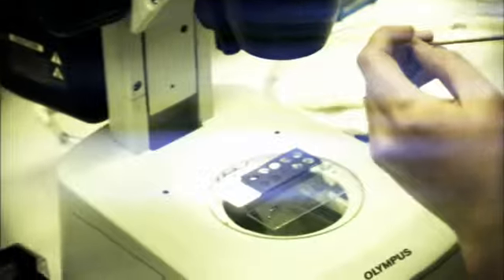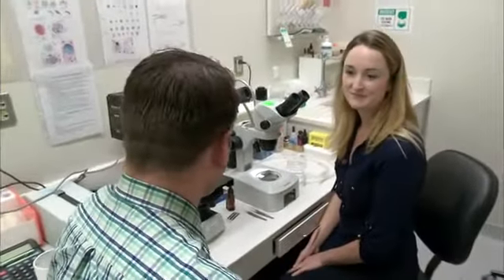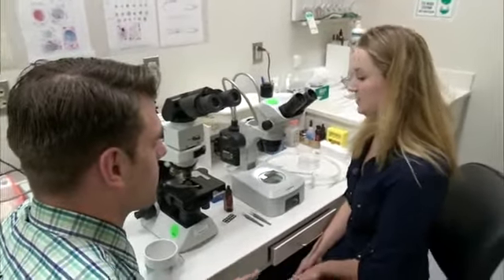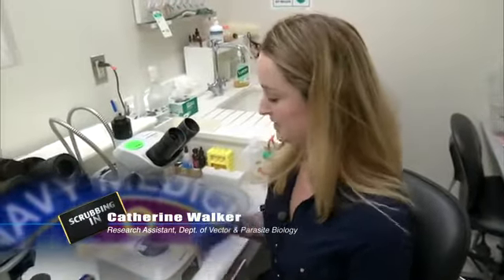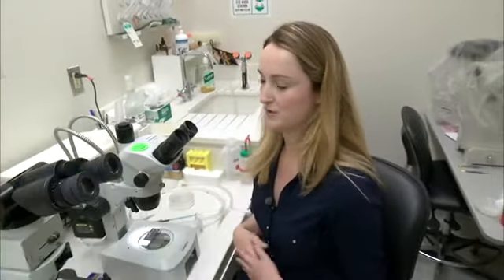Then it was time to meet Catherine Walker, a research assistant who actually dissects the mosquitoes to see if they're infected. So I'm here with Catherine Walker, a research assistant, and she's going to show me the next step, which I believe is dissecting these mosquitoes. Correct. So I'll be dissecting the mosquitoes that fed on you to remove their salivary glands, basically transfer them to a well and look at them under the scope to make sure that the mosquitoes were actually infected with sporozoites.